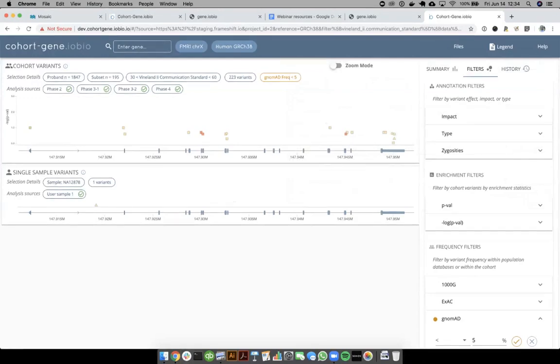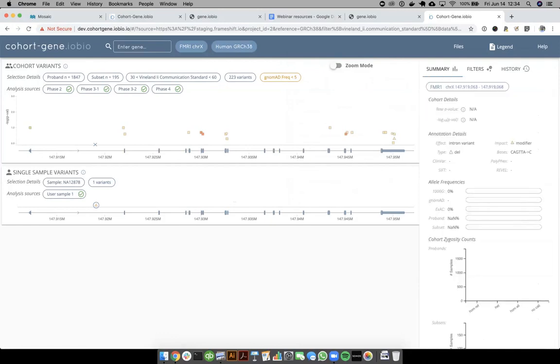And again, I can now look to see if this is a variant shared with the SFARI project, or in this case, the example project that we launched out. And so we can see the only variant in this particular case is not present in SFARI. So this is, again, a tool that lets us dig into the information in a single gene, and look for statistical enrichment within a cohort that we select. So I'm always able to go back to SFARI Viewer, pick a new set of samples, and then look for enrichment in there too. So I think that's sufficient information on these tools for today.